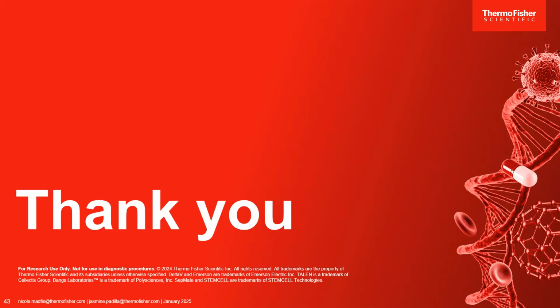All right. The next one here is what is the sample throughput for CytPix? Hi, I can take that one. So the CytPix can use tubes or plates. So it can use tubes with volumes up to 4 milliliters.